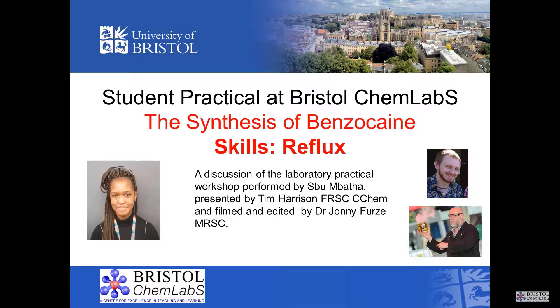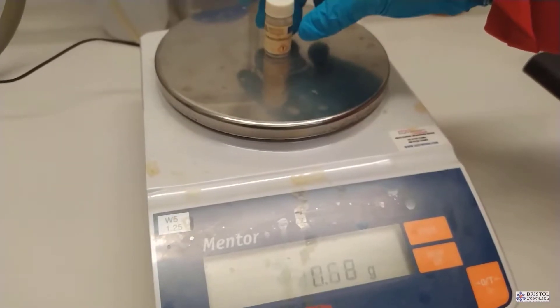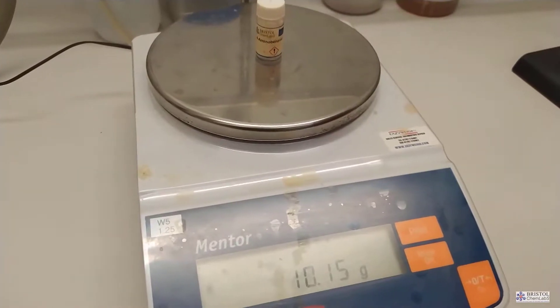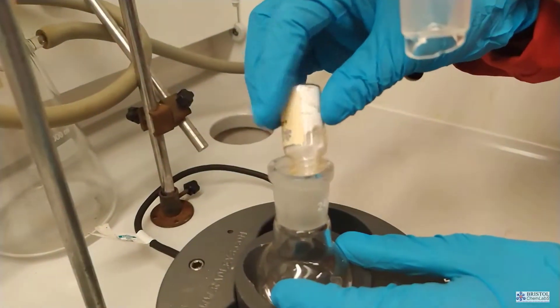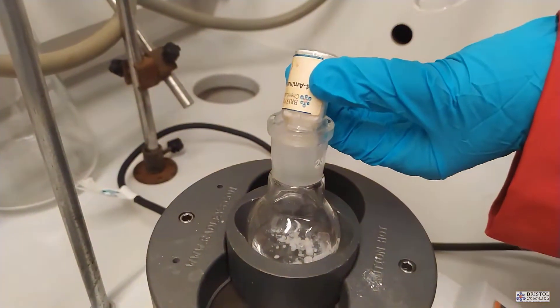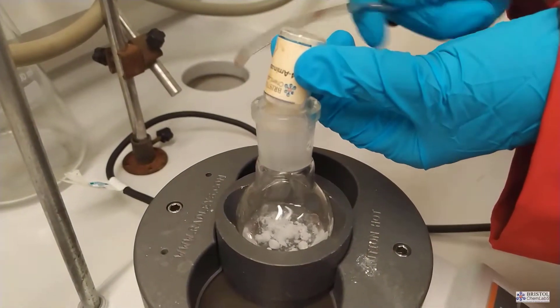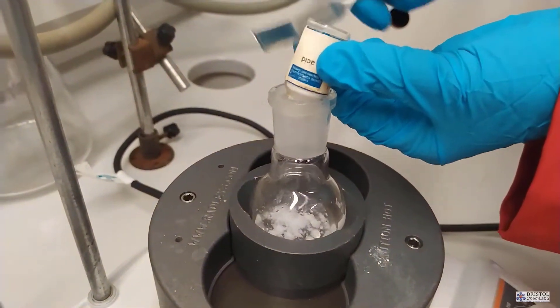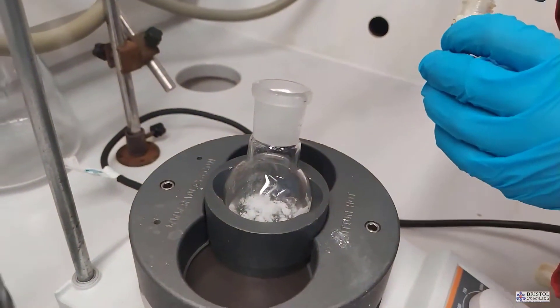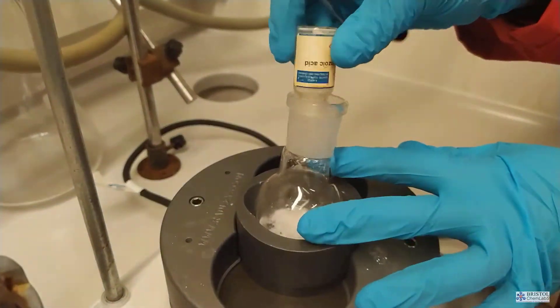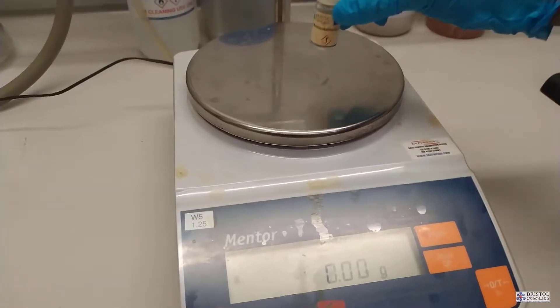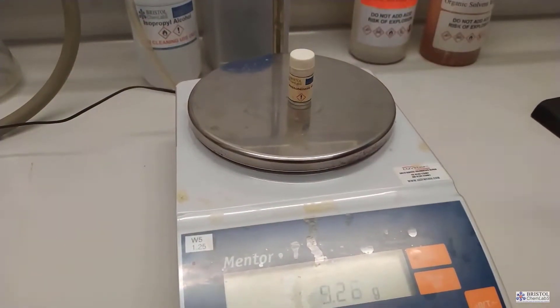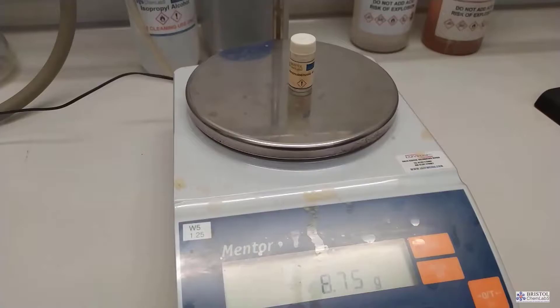To start the experiment we need to weigh out our starting materials that are not in excess. In the round bottom flask we already have the ethanol, a reagent in excess, and its catalyst concentrated sulfuric acid. The 4-aminobenzoic acid is the reagent that isn't in excess so it needs to be accurately weighed if we're going to perform a percentage yield. To start we weigh the small container that contains the 4-aminobenzoic acid. We then empty this container into our reaction vessel and weigh the empty container. The difference in the weights leads us to the mass of 4-aminobenzoic acid we actually have in the reaction.